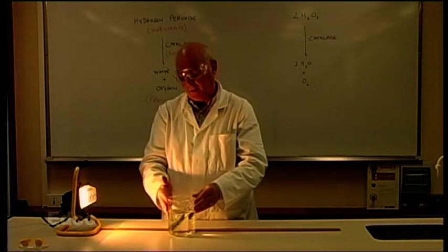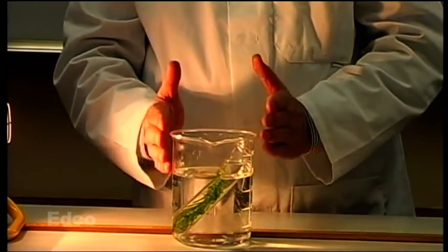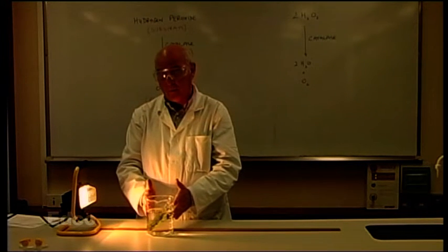Again, we move the apparatus in to the 20 centimeter mark, and we leave it 2 minutes to stabilize. At 20 centimeters, the average number of bubbles was 24 bubbles.